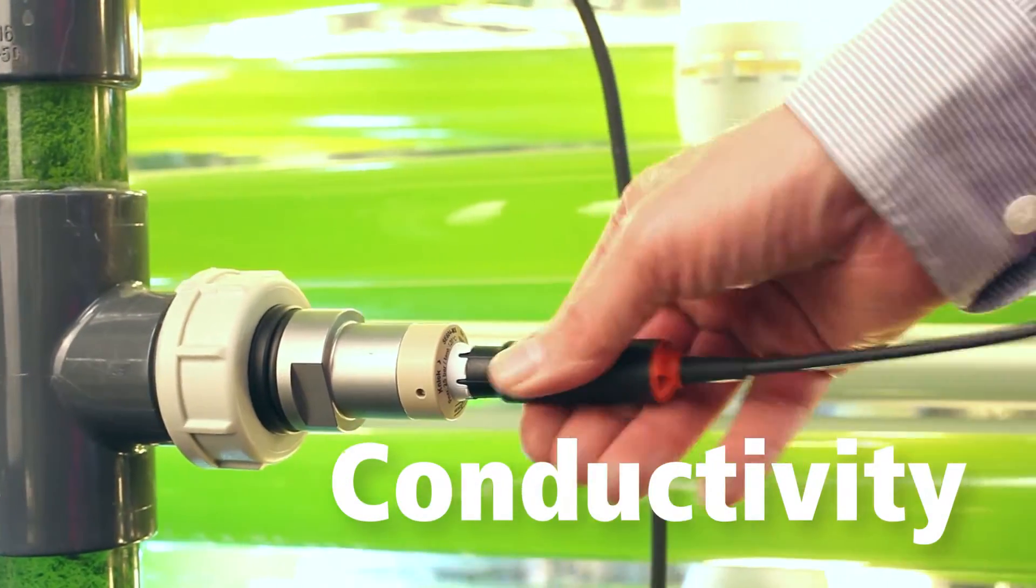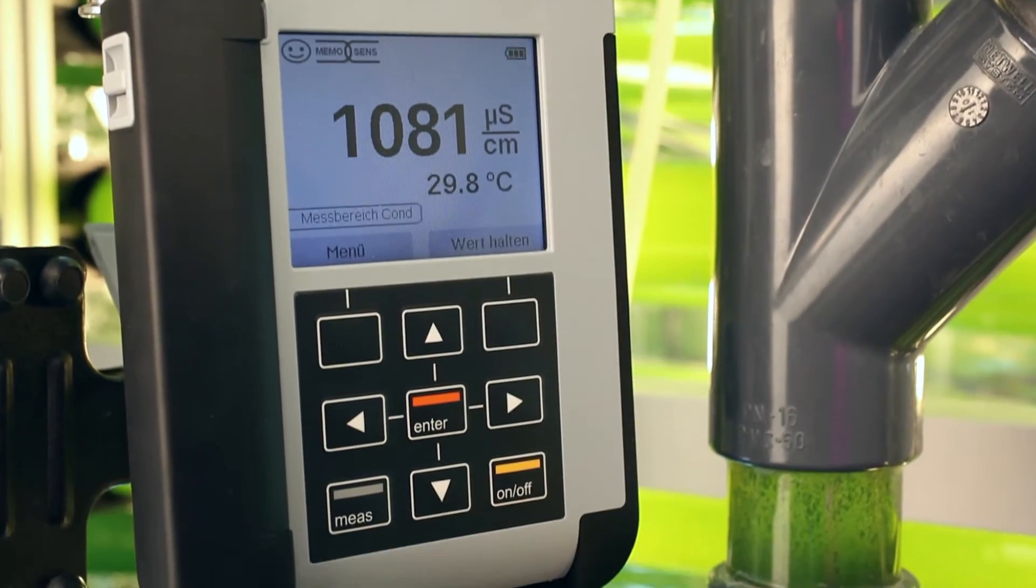Only one cable for all sensors. All data can be saved at the press of a button.